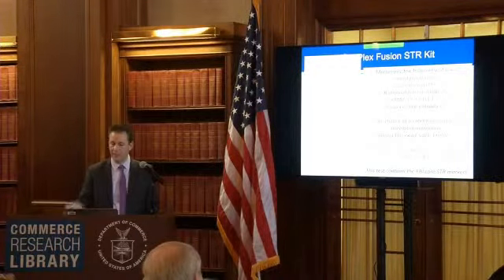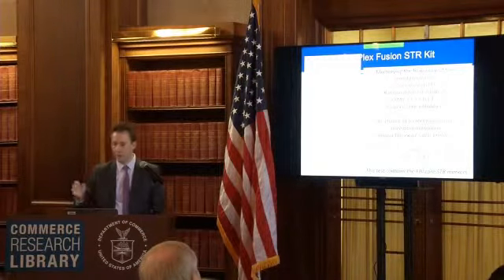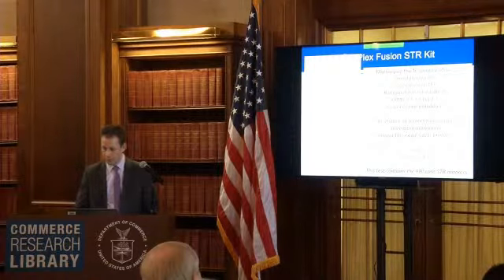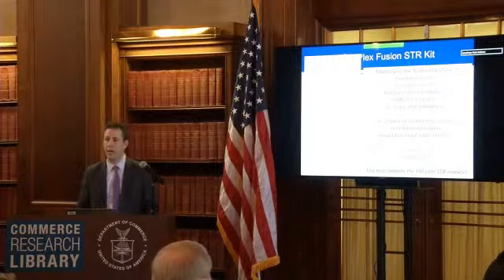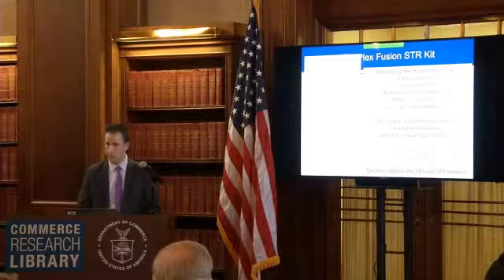So with these new tests, you're going from the idea of 10 to the 13th or 18th to 10 to the 40th or so. So it's a high probability of a low probability of someone having that exact same profile. So are there any questions on this? I wanted to take you through quickly how this is developed, and you could get a feel for what kind of information is in a human identity test.